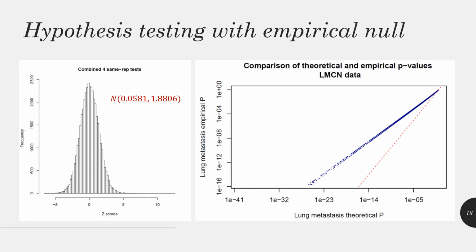Next, we offer a tool for empirical significance testing, which is useful to reduce false positive rates when some theoretical assumptions may have been violated in the real experimental setting.